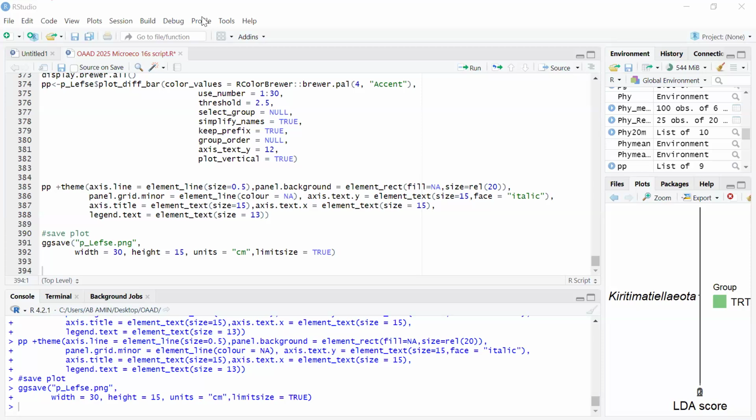Rather, I should stick to the relative concentration. That is why in most cases, microbial datasets are seen in relative terms, or they need to be converted or normalized to log base. But from qPCR, you can do that, and I'm not very conversant with that.